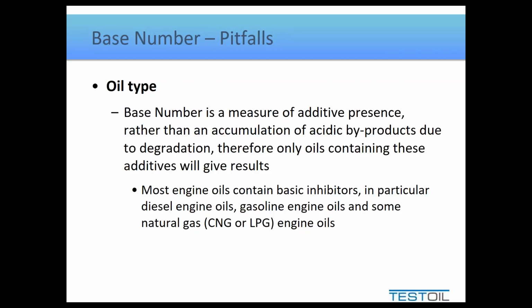If it's not something mechanical like oil level or a leak on the suction side, and you do think it has something to do with the fluid, generally speaking, what that's going to be attributed to is contamination, whether it's water or particulate, something along those lines. So those would be the tests that I'd be looking at first if I was suspecting there was something in the fluid causing the foam to change. Be looking at water content, particle count, maybe a little bit the elemental spectroscopy to see if anything was there. But no, not really FTIR, acid base number, viscosities. Those wouldn't really show anything.